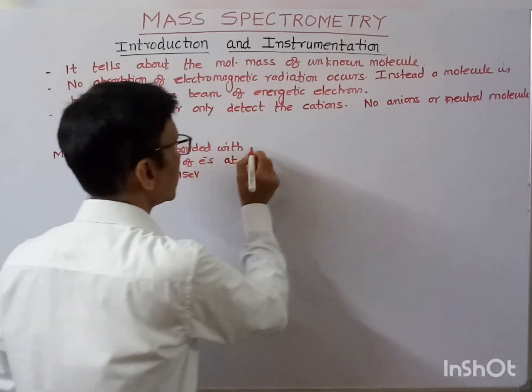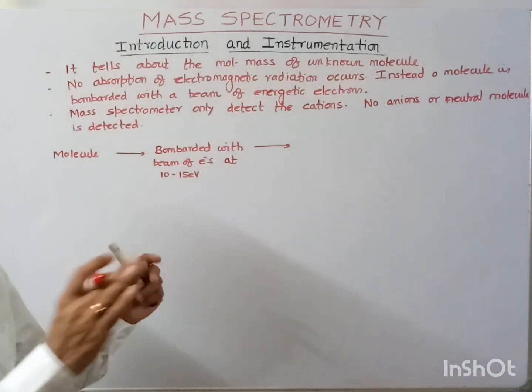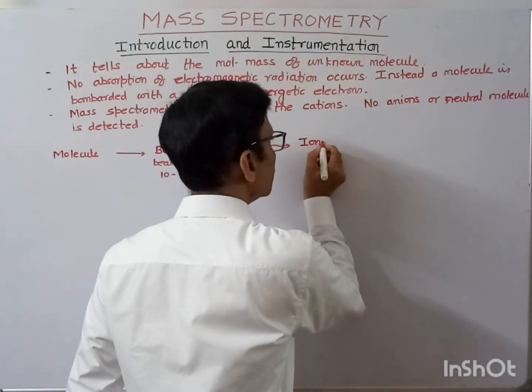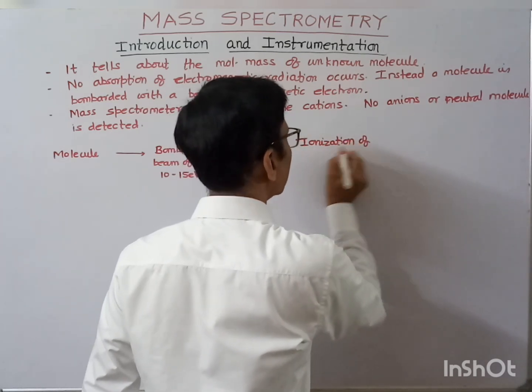So what will happen? The molecule will get ionized. So after bombardment, ionization of the molecule takes place.